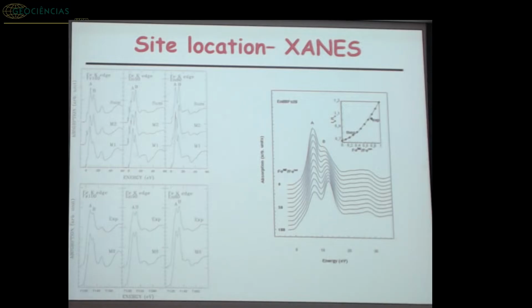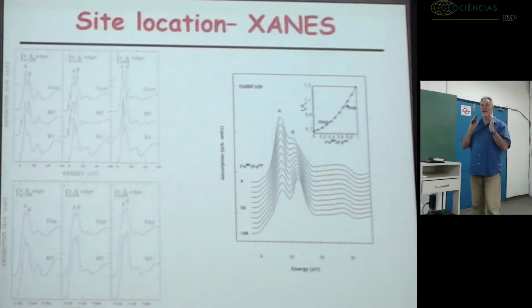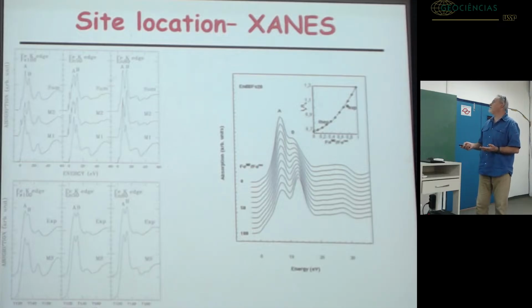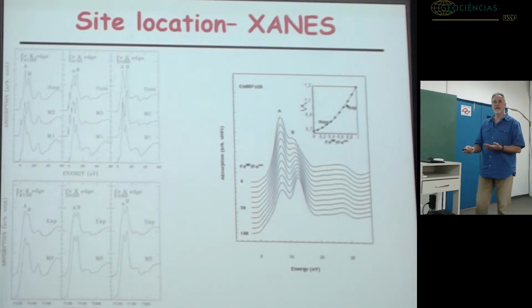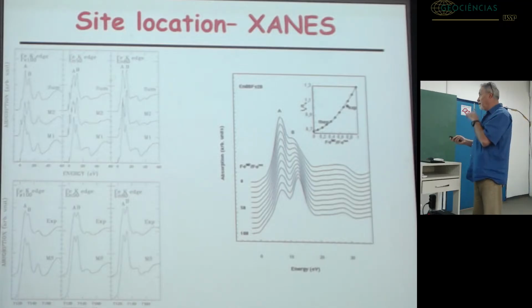But again, in case you have an orthopyroxene with very little iron content, both single crystal and powder won't give you anything because they are sensitive to the average electron density. So if you want to have a hint on the occupancy, even if in this case with a gross error, you can still rely on this technique because it does not depend on the concentration. As far as you manage to simulate good XAS spectra, the information you have is fairly accurate at whichever concentration of iron.